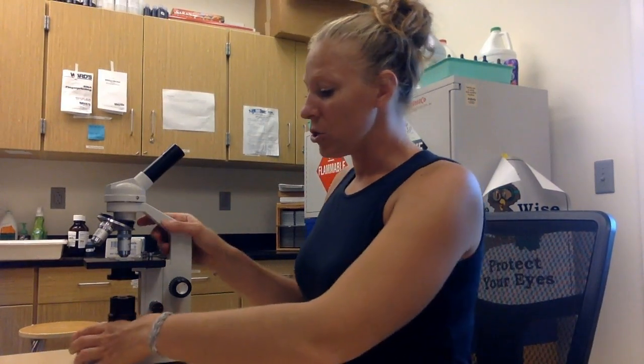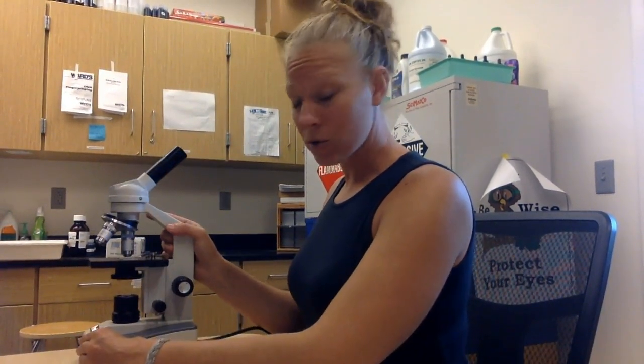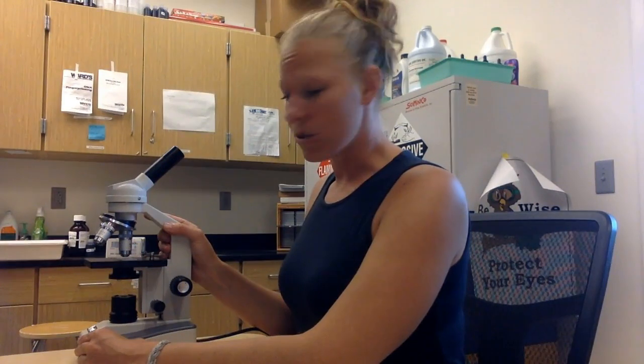One big no-no — and this is going to be loud — don't turn the microscope's nosepiece like that. It isn't good for it. If I hear that grinding noise, it's like nails on a chalkboard. Make sure you don't do that.